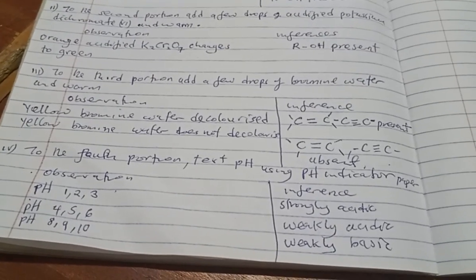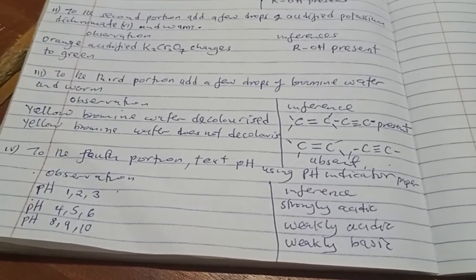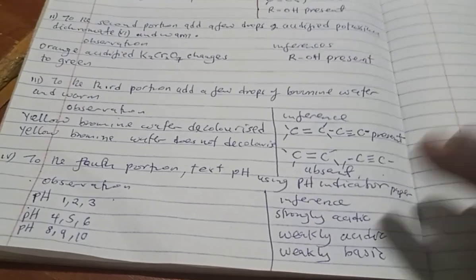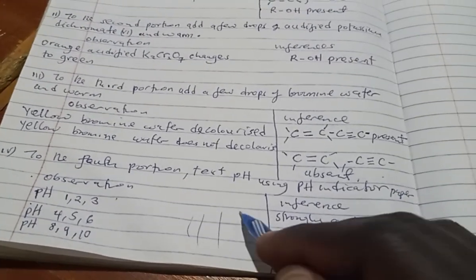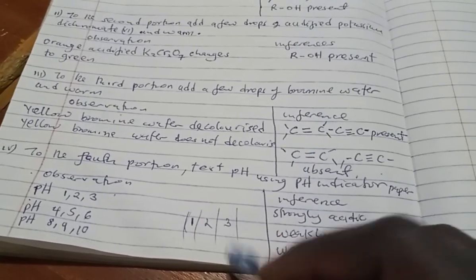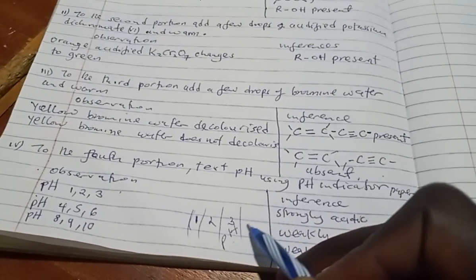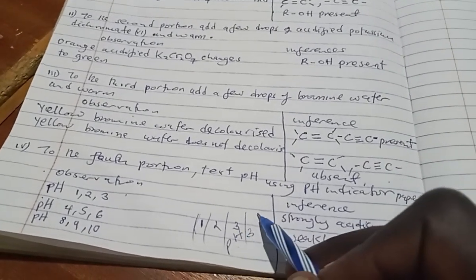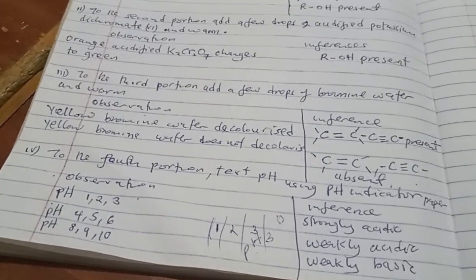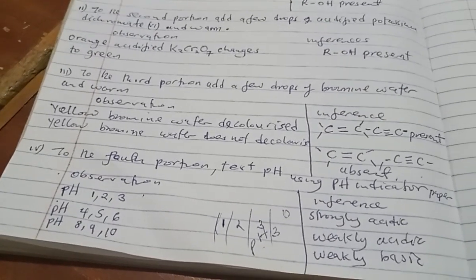Make sure you are just giving one value. Don't give us 1, 2, 3, no, just one value. If it is 1, say pH 1. You will see there are colors. So you say maybe this color is color number 1, color number 2. There are numbers there. So if you see 3, then you just write pH 3. If you see 4, pH 4. If you see 5, pH 5. This is an experiment you have to do, and you have to see.